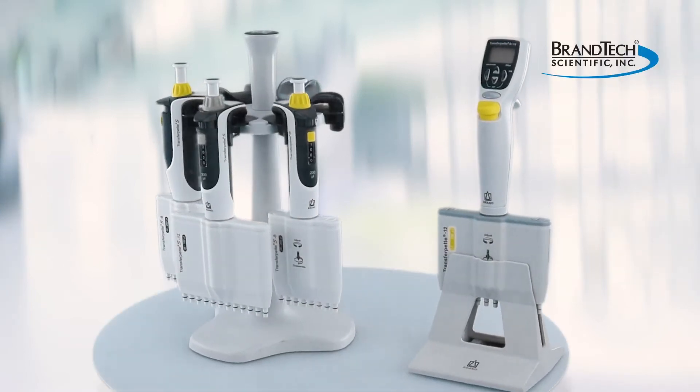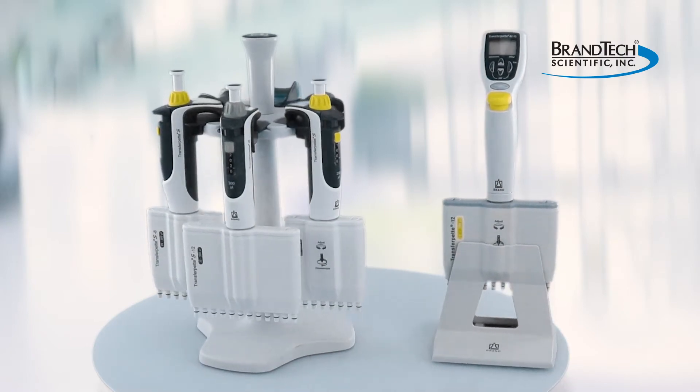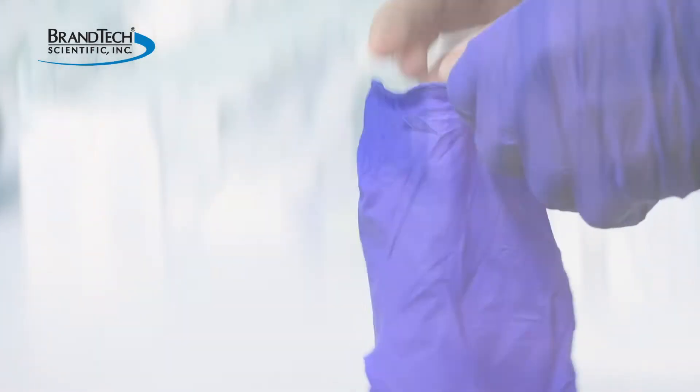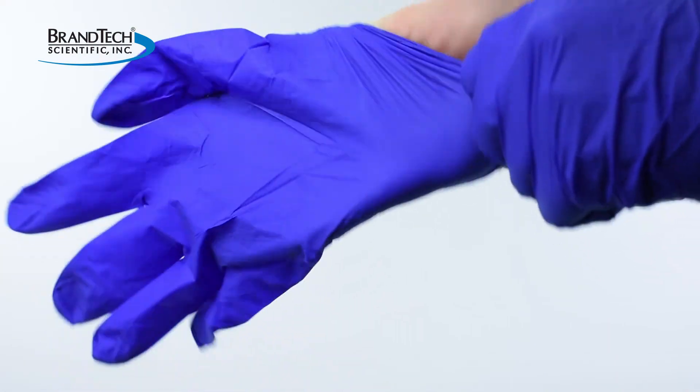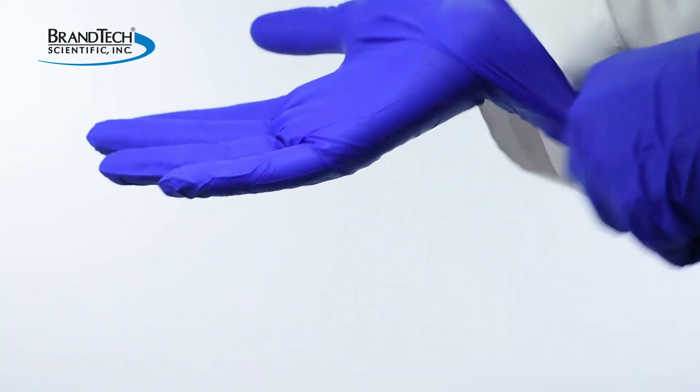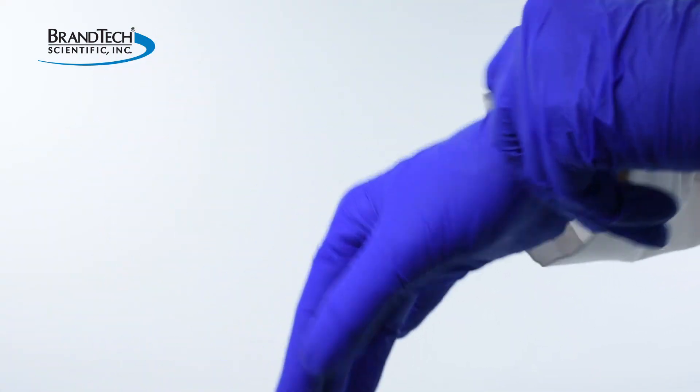This video demonstrates how to change O-rings on the tip cones of any Transferpette multi-channel pipette. When working with a Transferpette multi-channel, wear all appropriate personal protective equipment and observe all safety precautions.